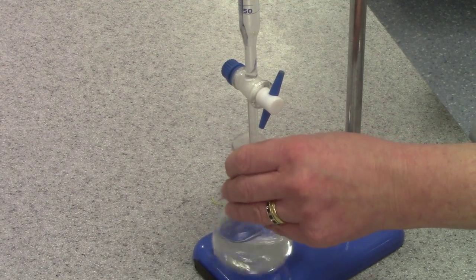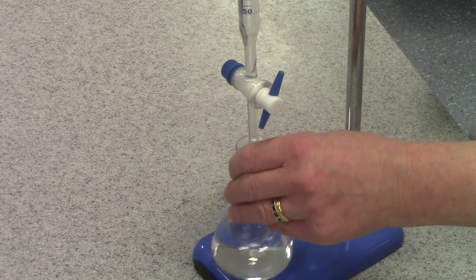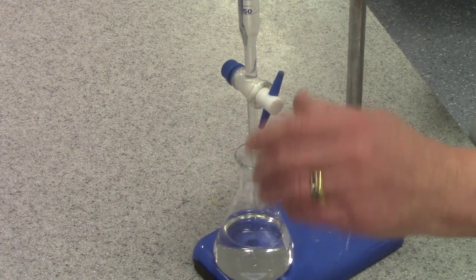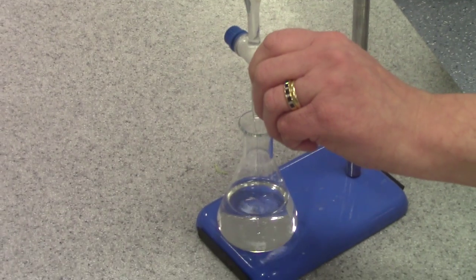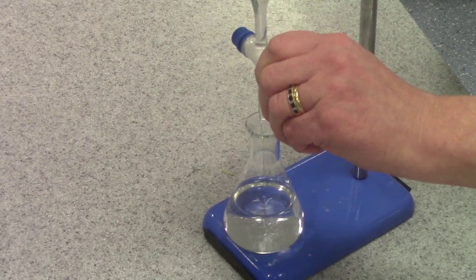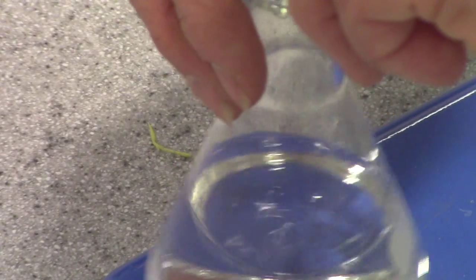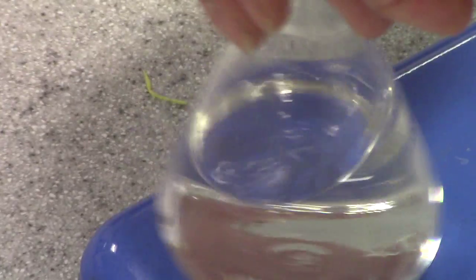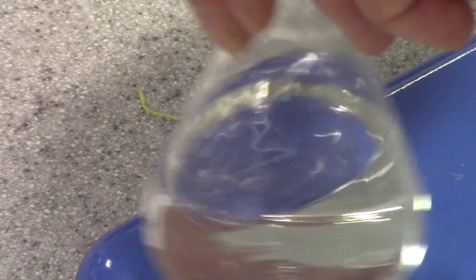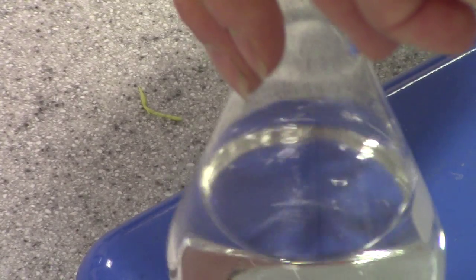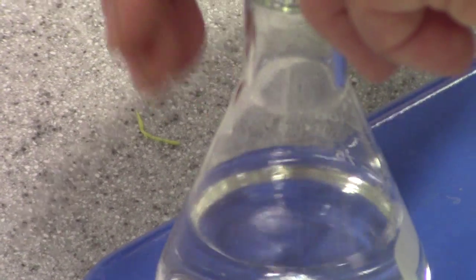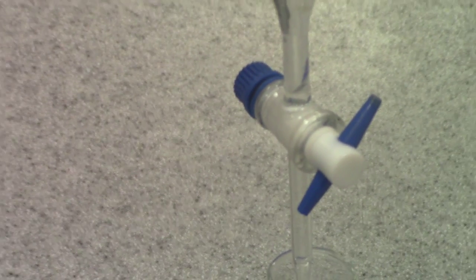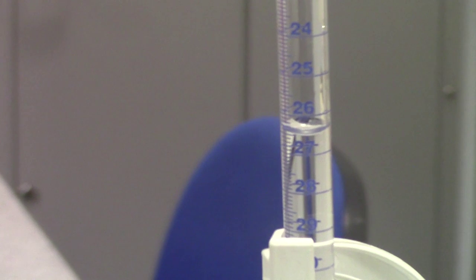When I start to see the colour change, I'll slow down by closing the tap slightly, so I'm adding it drop by drop, looking very carefully for the colour change. When I'm satisfied that the colour change is taking place, I close the tap and record my final volume, again from the bottom of the meniscus.